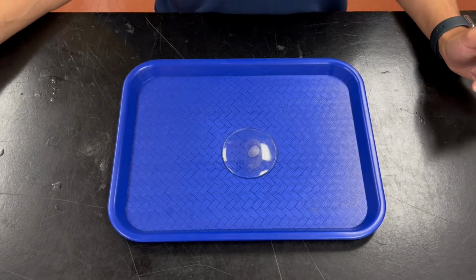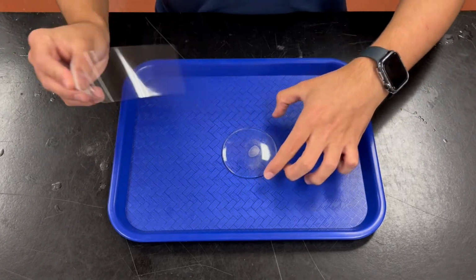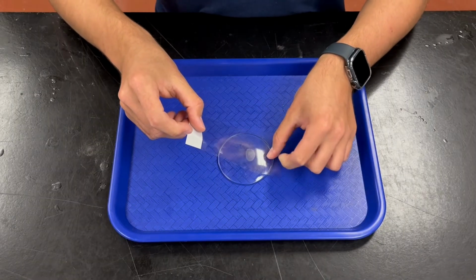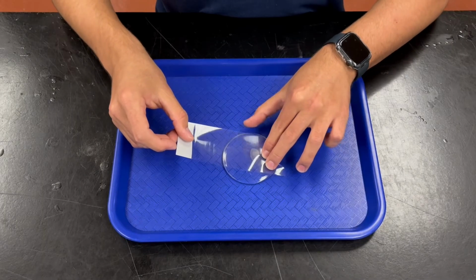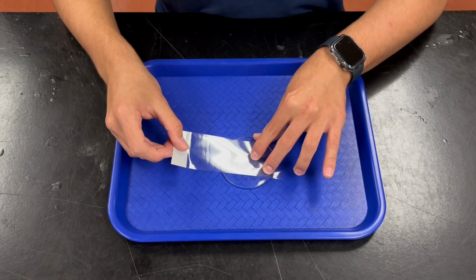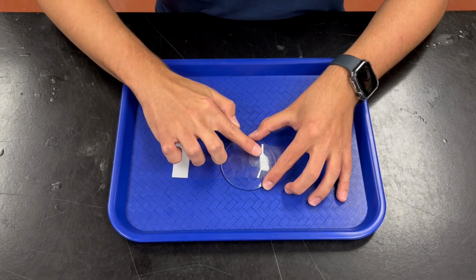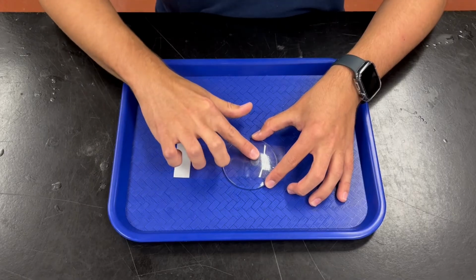Alright, now I don't know if this rings any bells, but we will be making an anchor point in the corner of the glass with our collecting tape. Let me just make sure that my fingerprint is in a good position. This is the part that always gets me so nervous. If you apply too much pressure with your finger, you could destroy the fingerprint. So we're going to be very gentle, tapping over the fingerprint like that, making sure that you get rid of all the bubbles. All right.